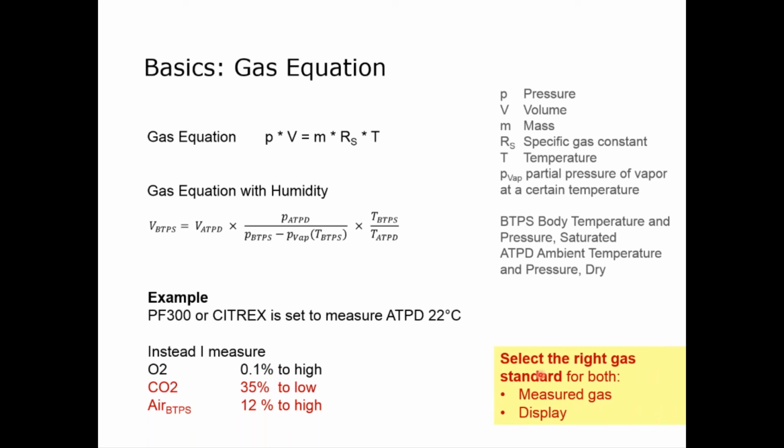Good practice rules: select the right gas standard for the measured gas and for the display. So select the right gas properties and select the right gas standard for displaying.